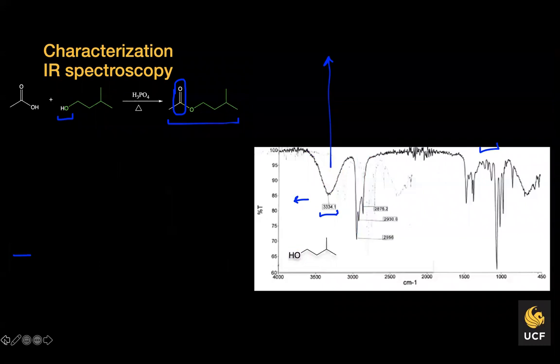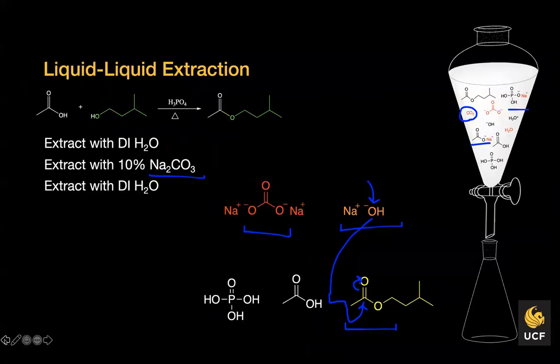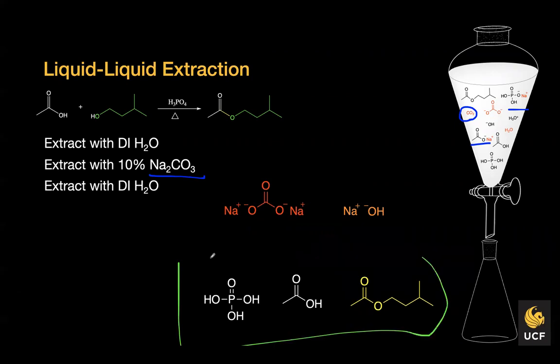Let's go back. Okay, so remember, all you have in solution are those molecules, and then plus water.